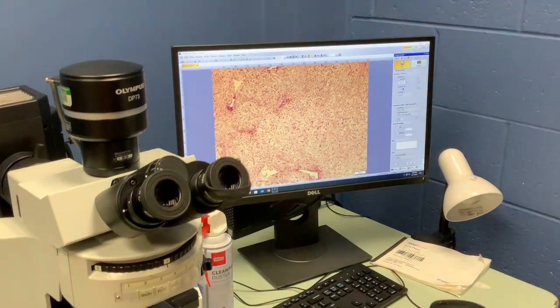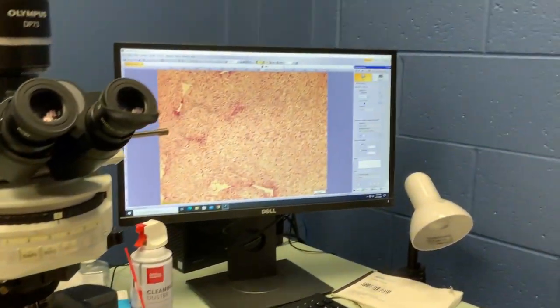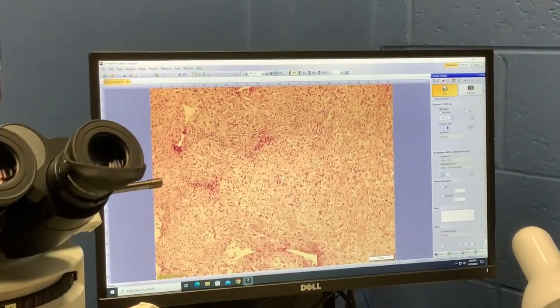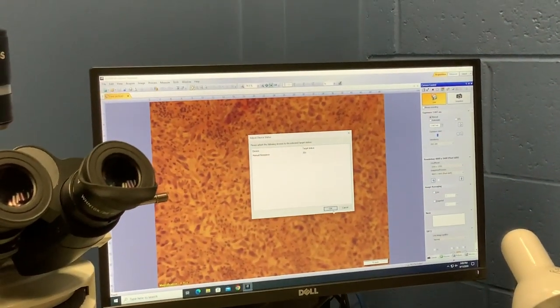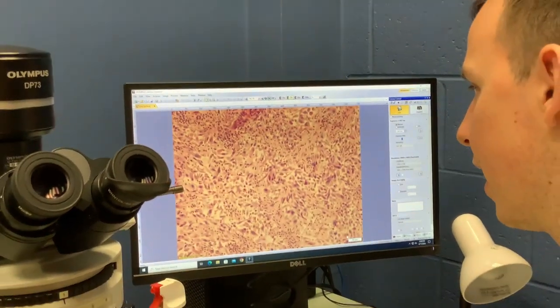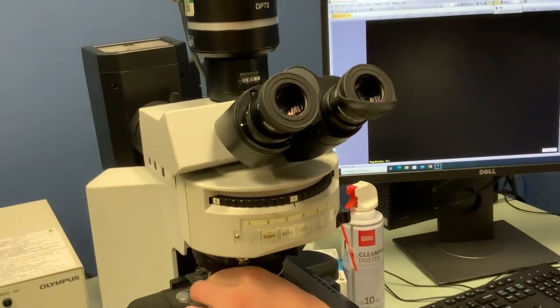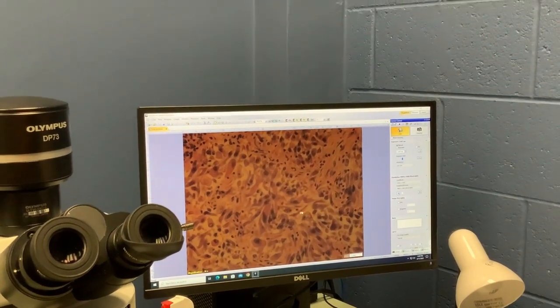You can see we're on 10x right now, but up here we have 20x selected. Up in the top corner, hit that button and hit OK — it just makes sure that everything, including the scale bar, is correct. So if we switch to 20x, we hit the 20x button and it makes sure that, besides changing the scale, everything is properly set in the microscope for that objective. If we go to 40x, again hit 40 — this is basically just telling you to make sure you've turned the nose piece, which we already have — and hit OK.